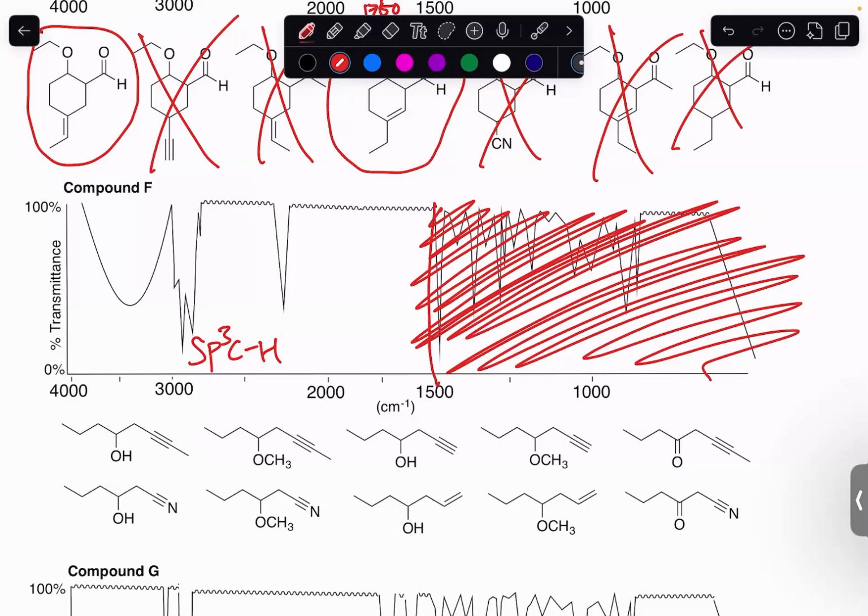And I see that there's one that's spiked over there. Is that the triple bond? Yes, this peak right here is gonna be between 2100 and 2300, which is the triple bond region. And what 2 functional groups are going to be possible here? Nitrile or alkyne.